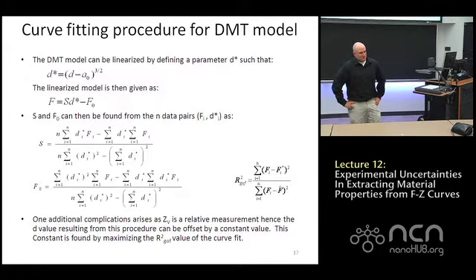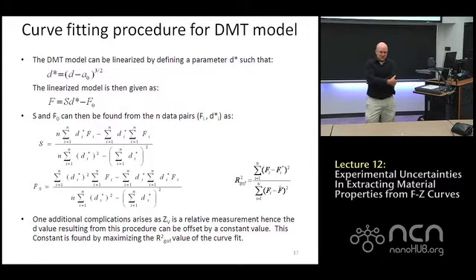Doesn't matter, does it? Well, if it doesn't matter, then I can make D whatever I want it to be. Right, but ultimately you just take the Z numbers, whatever they are, and choose the Z to be 0. So ultimately, Z is arbitrary. D is arbitrary to a model. If you have a model, that will determine where your 0 in D is. So you need to choose Z such that your 0 in your model is the best 0. Well, how do you get to the best 0?